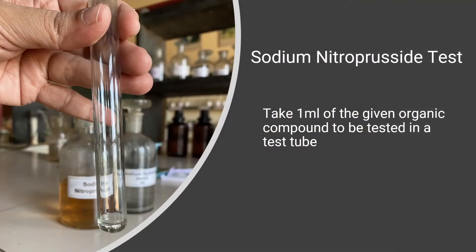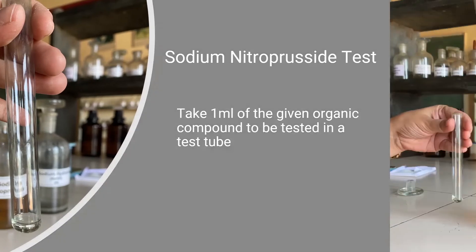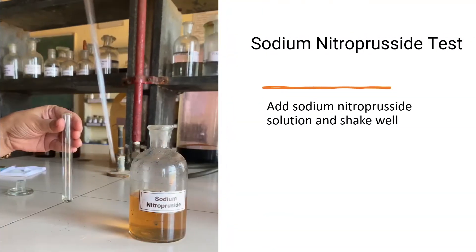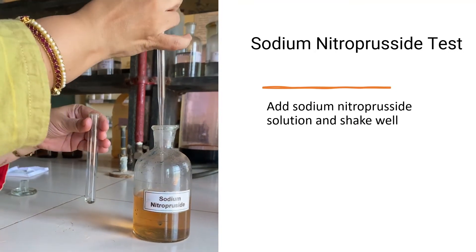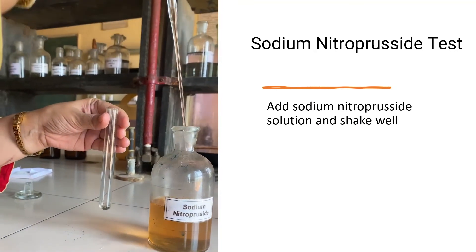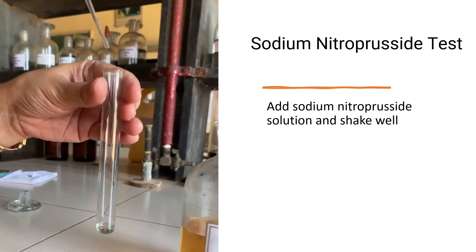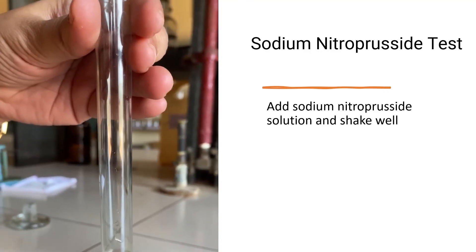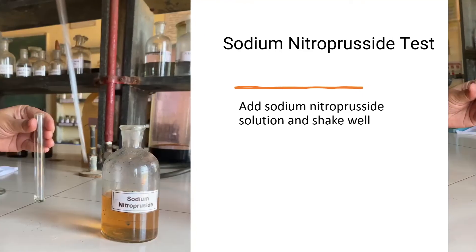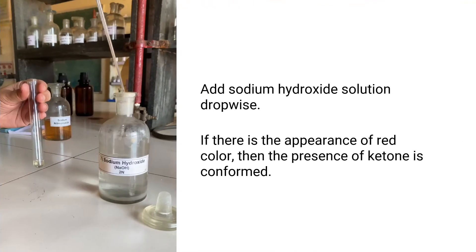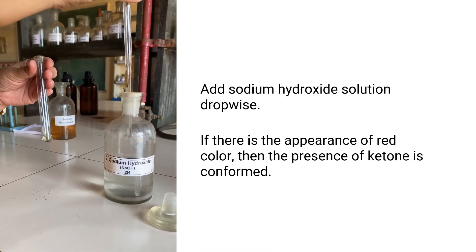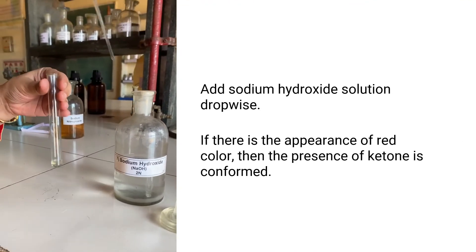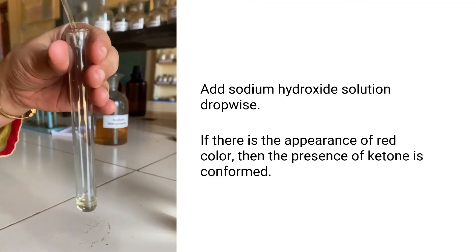Take the substance to be tested in a test tube. I have taken acetone. Add sodium nitroprusside solution to this and shake well. Then add sodium hydroxide solution dropwise and observe the color.